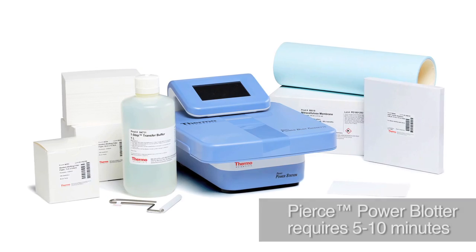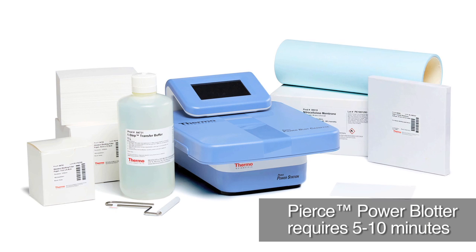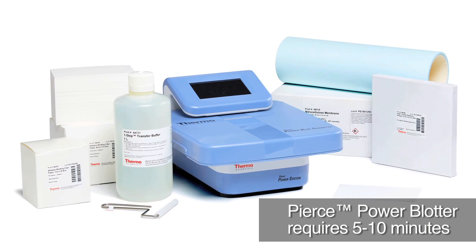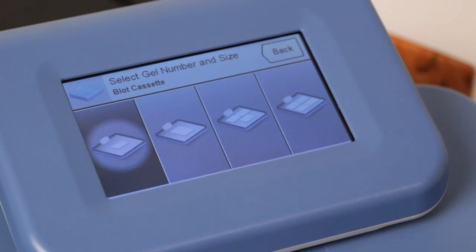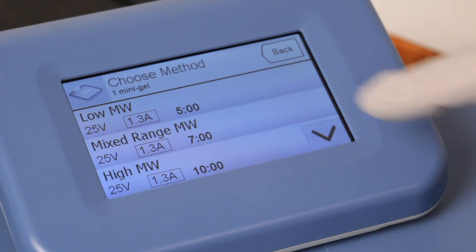But when used with Thermoscientific Pierce One-Step Transfer Buffer, the Pierce Power Blotter delivers similar performance in as few as five minutes for one to four mini-gels or one to two mini-gels simultaneously.